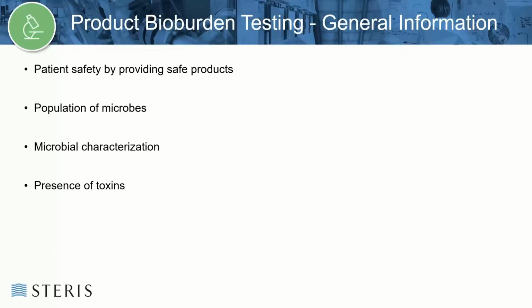Bioburden is considered an estimate, as not all culture conditions can be evaluated, and not all organisms can be cultured. In addition to establishing a count of the microbes, the types of microorganisms observed on a product are critical to the quality control of the manufacturing process and maintenance of a sterilization validation. Characterization of the bioburden can inform risk assessment related to sterilization.